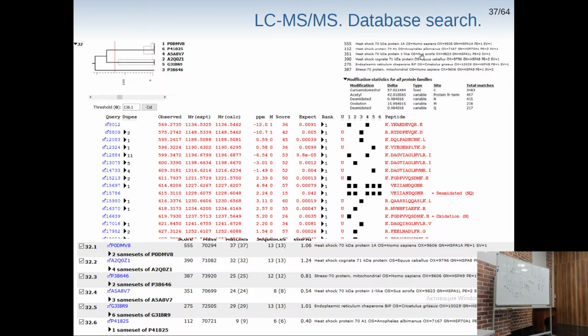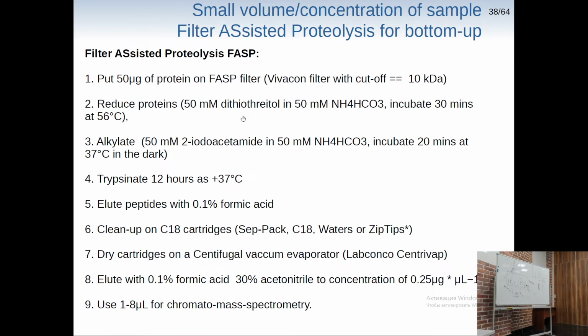Because probably we can use some pig trypsin, which is also used, and it can be just poorly purified before the application, right? For instance. But in this case, I think that it is the most probable candidate, and as you can see, it's something that is common for all of them three. It has a lot of peptides which were found here. Okay.